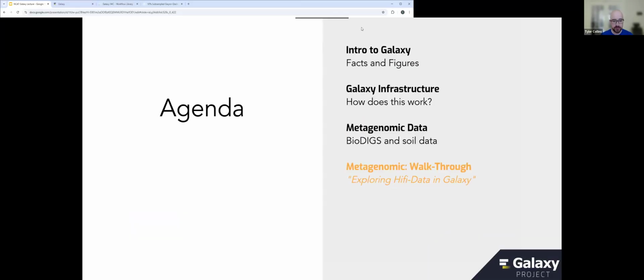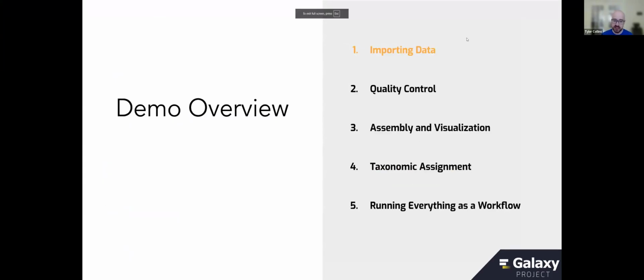And we'll continue. So this is the overview of what we're going to be doing in Galaxy. I'm going to be hopping between these slides. I have screenshots of everything that we'll be doing, organized by the main sections. I'll come back to these overview slides whenever we hit a checkpoint. But other than that, I'm going to be doing the crazy thing of trying to do this live and make sure it works right, and just hope nothing goes wrong as we run through this.